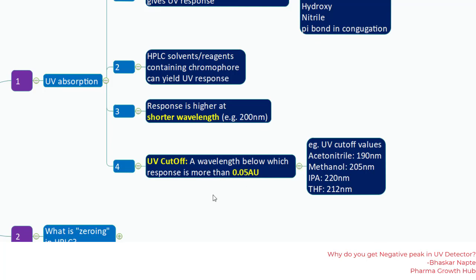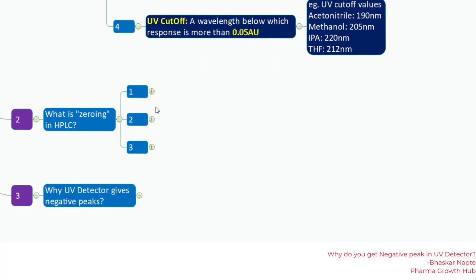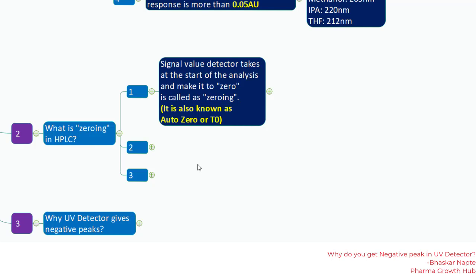I am building background to understand where absorptivity comes from. The second important point in understanding the negative peak phenomenon is called zeroing. In UV spectrophotometry, the analyst performs an auto-zero — you put in the diluent and set whatever absorbance value appears on screen to zero. The same principle applies in HPLC analysis. Zeroing is when the signal value detected at the start of the analysis is taken and set to zero; it is also called auto-zero or T0.